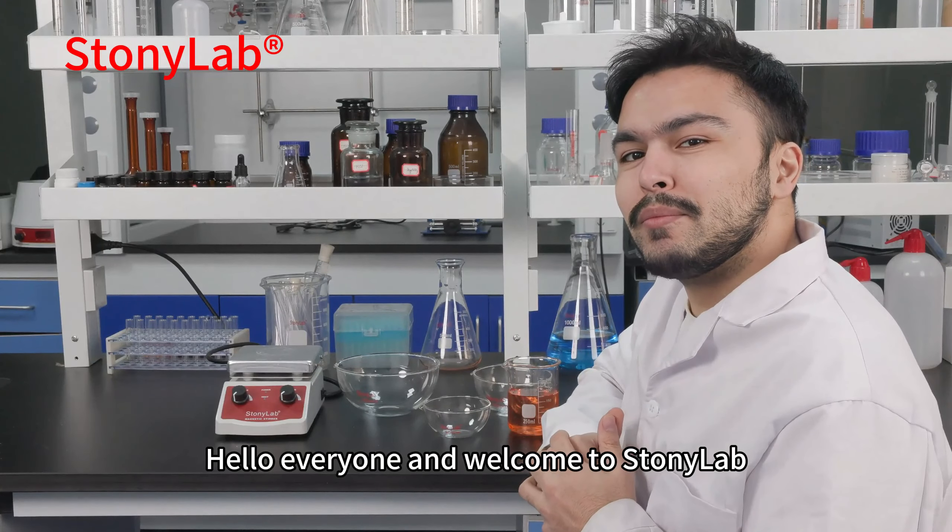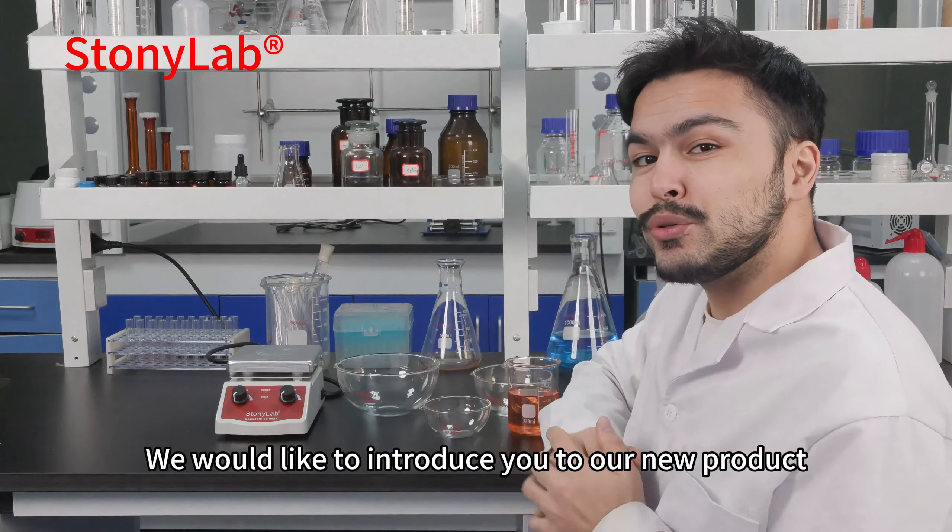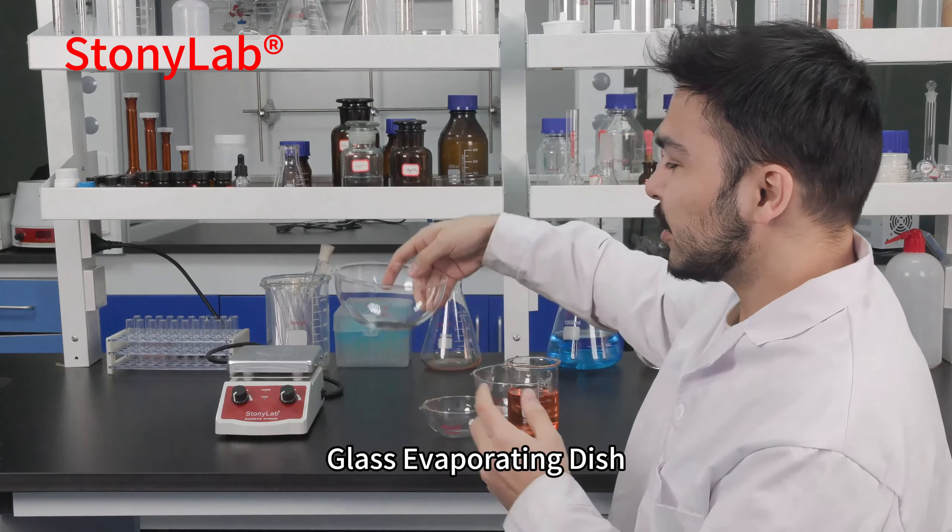Hello everyone and welcome to Stonyalab. We would like to introduce you to our new product, the glass evaporating dish.